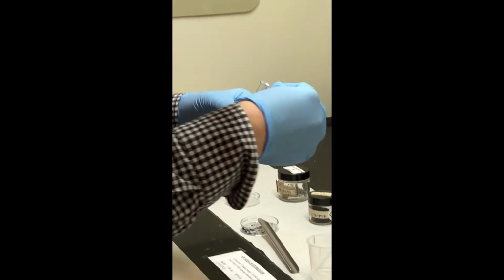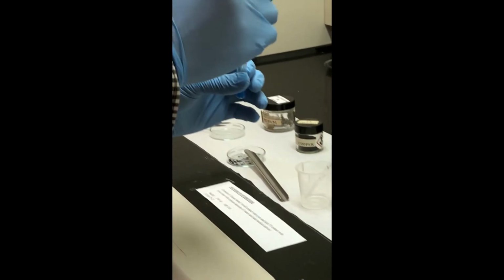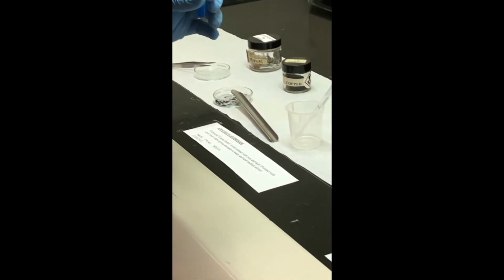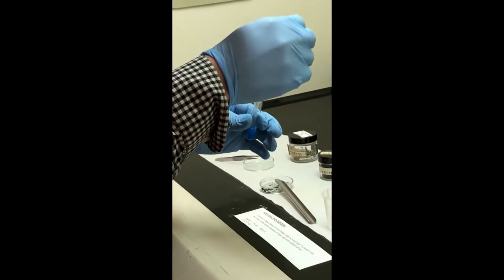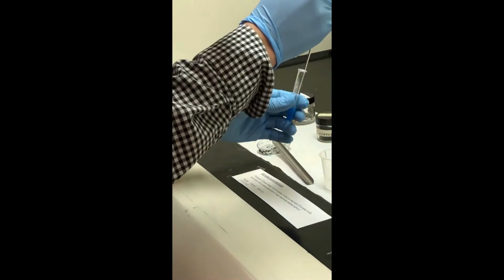So after my first 10 drops, I'm going to agitate the solution with a stirring rod. And then we're going to add an additional 10 drops.